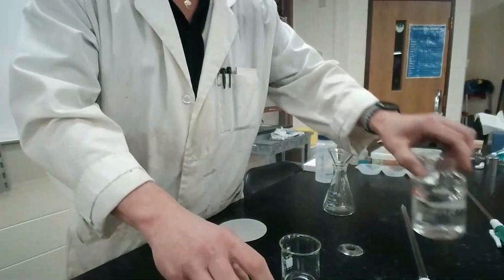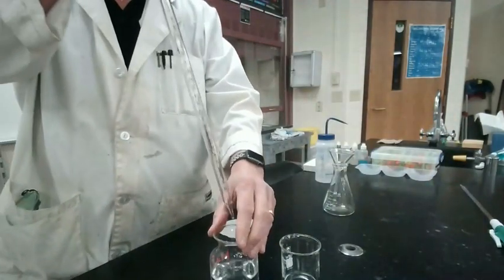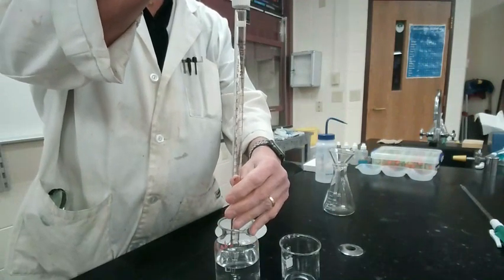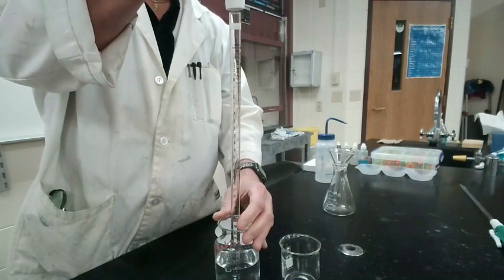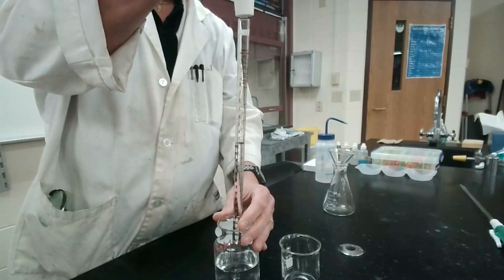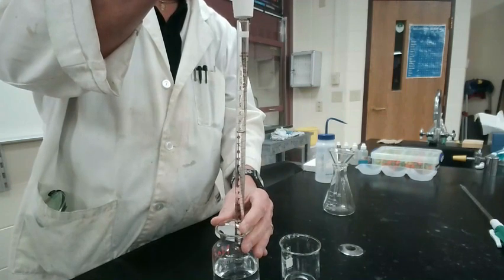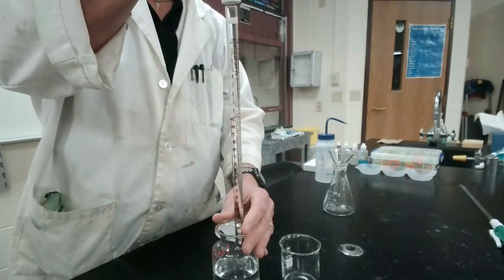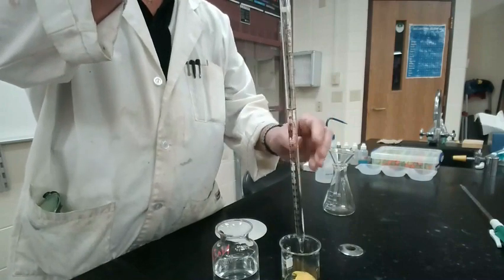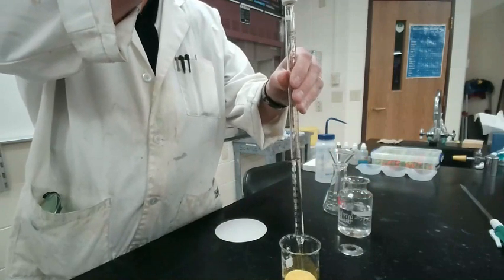Next, ladies and gentlemen, I'm going to add 20 milliliters of sodium iodide. I have a different container here. I'm going to pull up the solution until I have exactly 20 milliliters in here. Looking at the side, you would have done the same in class. Now that I have exactly 20 in here, I'm going to add it, and you'll notice the color change immediately when we mix the two together, ladies and gentlemen.